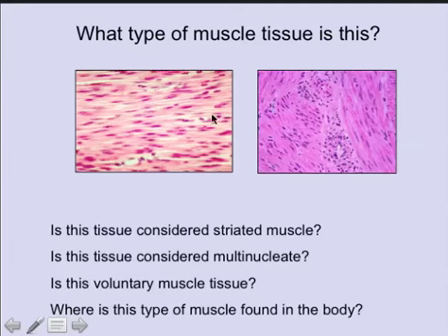So if you look here, that's a smooth muscle cell nucleus, as is that, and that. What happens when the muscle contracts is that these spindle-shaped cells will shorten, and as a result, if we're in the linings of a blood vessel, the diameter of the blood vessel will shrink. That's what we call vasoconstriction, as an example of smooth muscle activity.